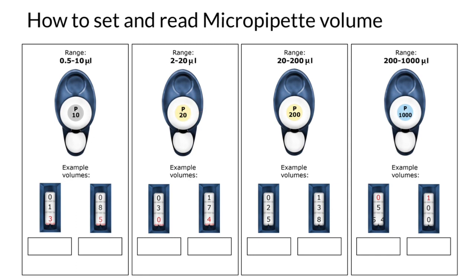And P20 here stands for the maximum volume of 20 microliters, as you see, and the range is between 2 and 20 microliters.